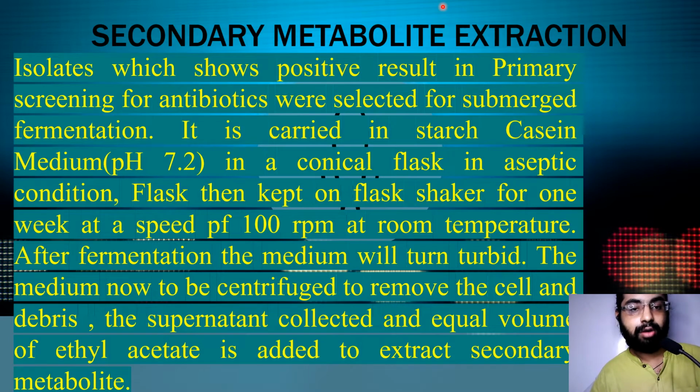The medium is now centrifuged to remove the cells and the debris. In the collected supernatant, an equal volume of ethyl acetate is added to extract the secondary metabolite.